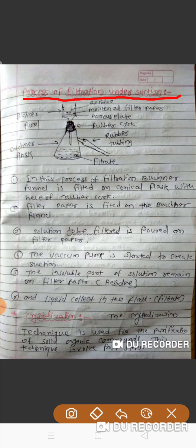And this tube is connected to a bottle to avoid the residue going into the solution. This is the apparatus, or the figure, for the process of filtration under suction.